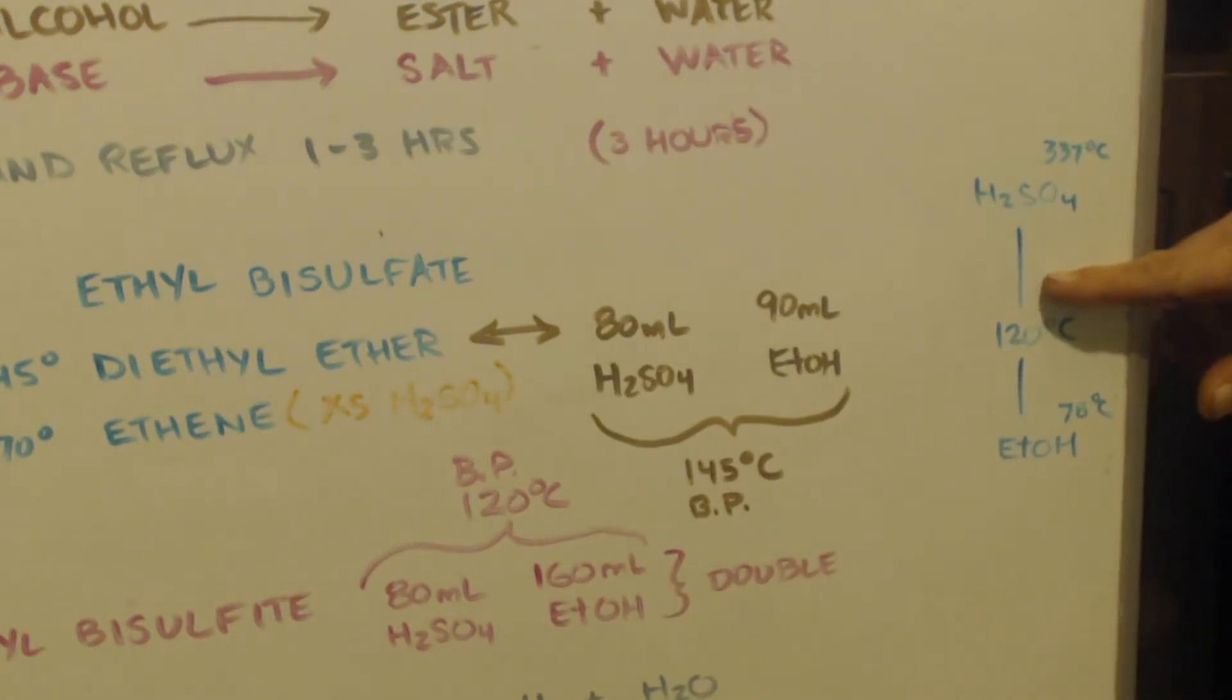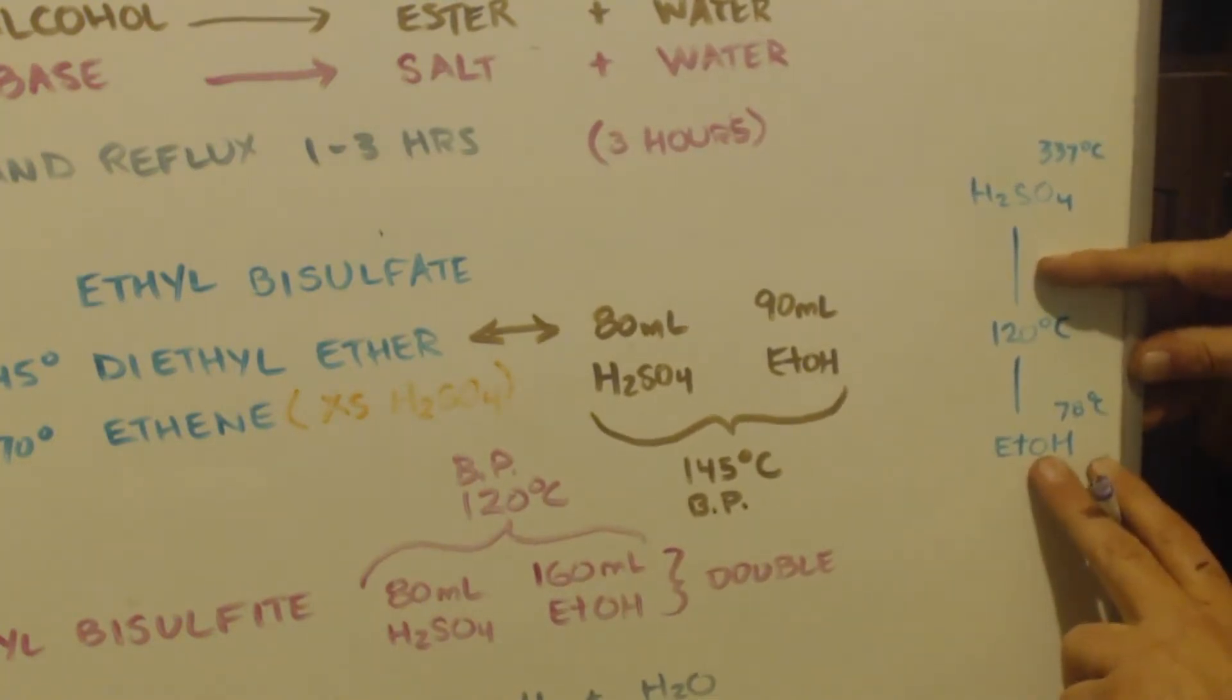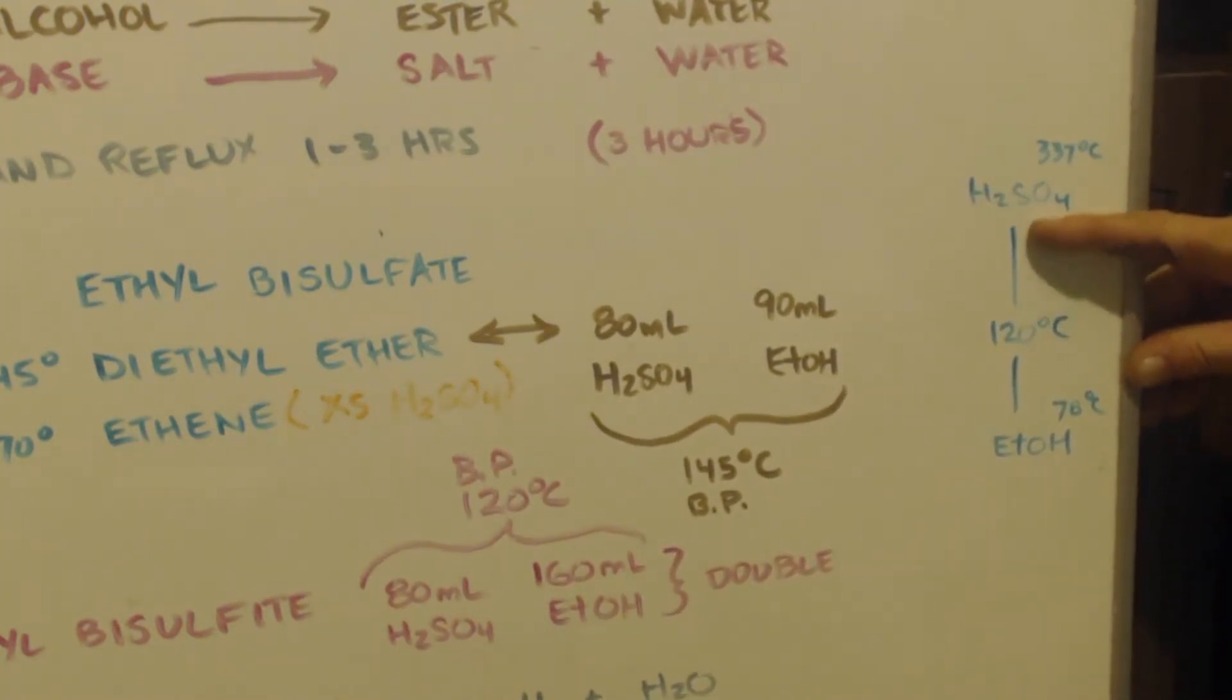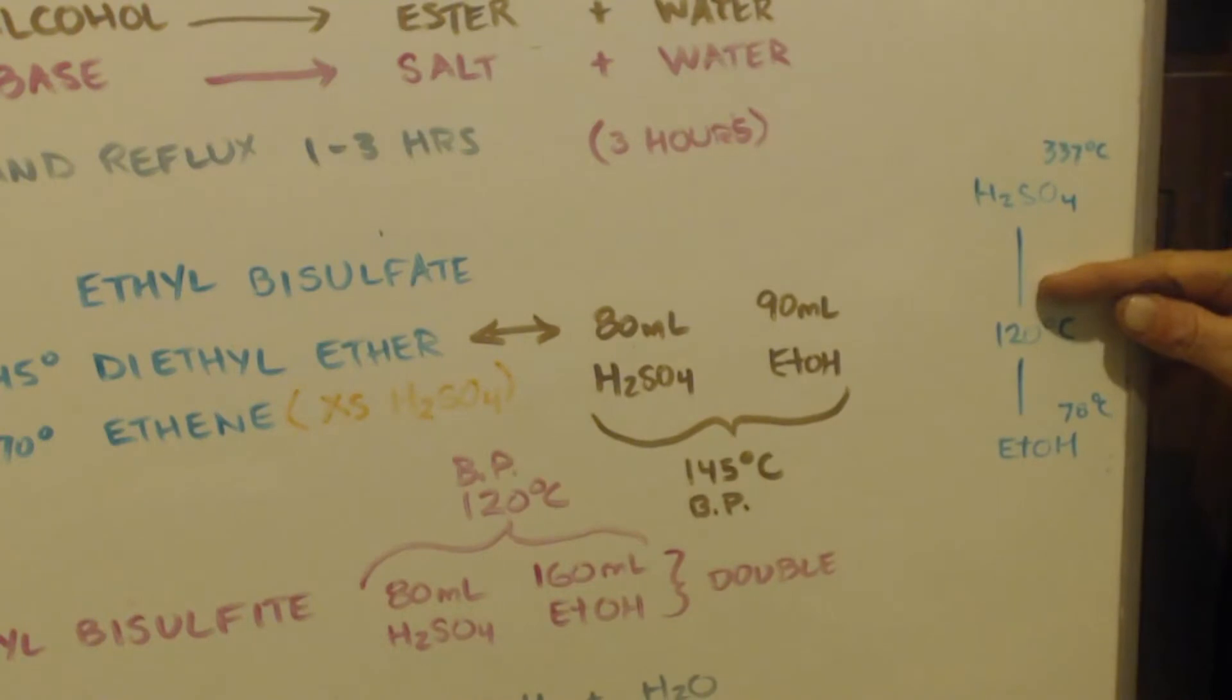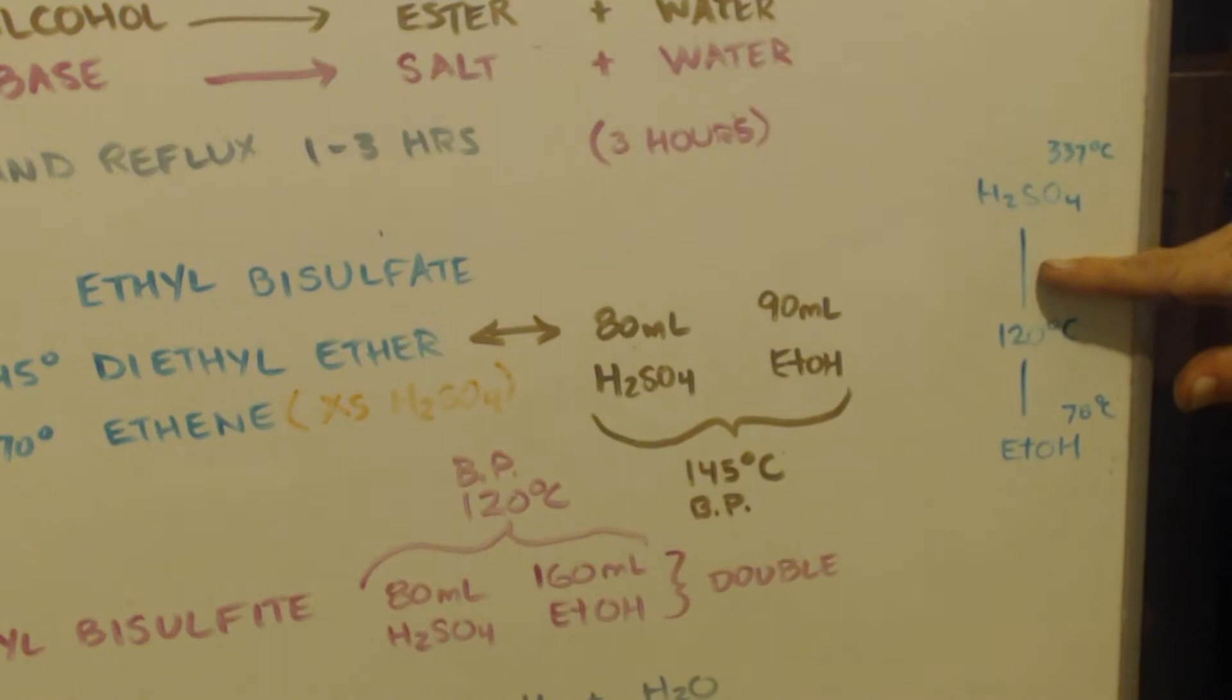So if you want to lower the boiling point of the pot, you add in the lower boiling point thing, the ethanol. If you wanted to raise the boiling point of the pot, you'd add more sulfuric acid in it. So all you have to do, if you're here with 80 and 90, obviously, you need to add more ethanol so it gets the boiling point down to 120°C. That's where you want to reflux it at.